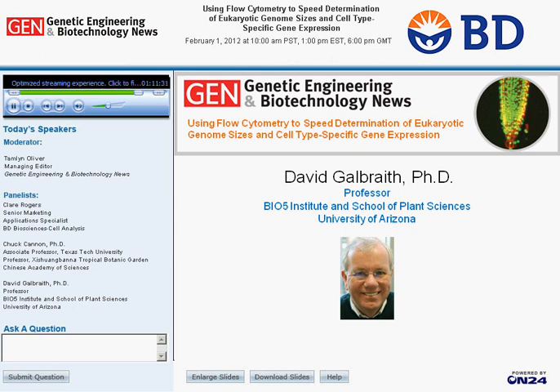We should emphasize that there are lots of secondary products that are produced by plant species, mainly to ward off insect attack over evolutionary time, and including various additives routinely in the chopping buffer is sometimes absolutely necessary. The additives can be things like ascorbic acid, reducing agents, or things like polyethylene glycol or polyvinyl pyrrolidone, which are molecules designed to absorb phenolics and other secondary products. And so you will have to optimize the chopping buffer as well for difficult species.